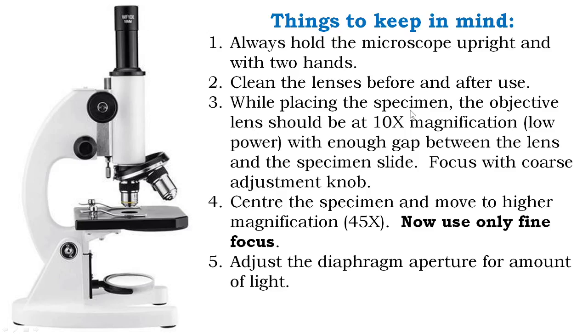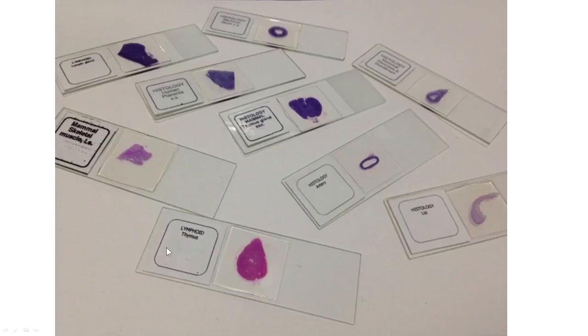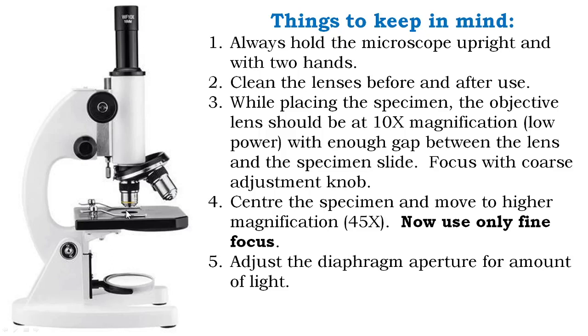And then while placing the specimen, the objective lens should be under 10x magnification. Ta desia manju gi ta dela chala di shagro specimen manju gang specimen de roji dela glass light dela shawa chasha igun di gang la shawa chasha ro shadu shaga du du zamba langa thona kharte gore la bim bana di para la gap yapu korta stage ta objective lens ki para la gap yapu kor gap yapu me bim bana azu shego de shadu maro. So this gap yabu yonwa lang azu kharche gu gore lowest magnification ka lasha gore. Dela lowest magnification ki objective lens di kharcha dure lana 10x di cha dure. Wa 10x di ka lasha. And di wala kiranzu gi specimen di ka la digirwa.